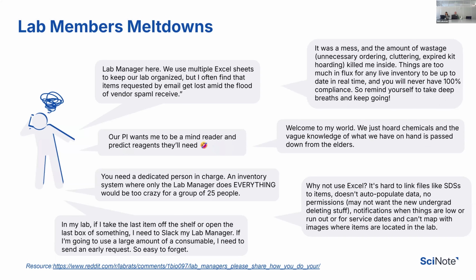I'll leave this slide on because it's my favorite from the previous webinar. So some of the meltdowns we heard, some of the meltdowns we found on the internet. I'm sure some of you can find yourself in one of these quotes. Inventory management is not an easy thing, and it does involve a lot of people using inventories and systems and processes in the correct way.